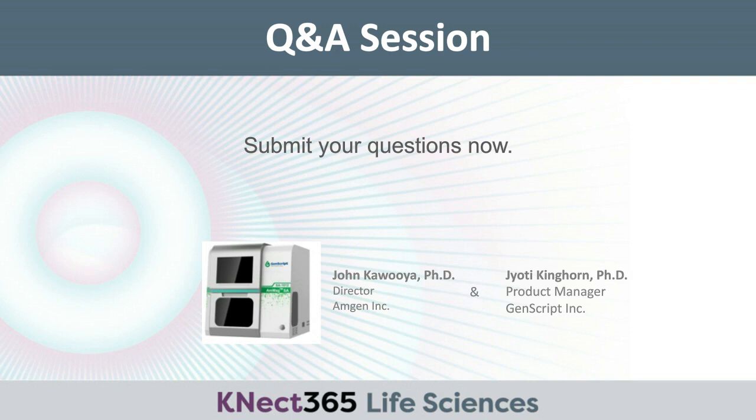No, you can use it in both. In fact, our laboratory now is switching our platform. We're getting rid of centrifuges in general, because of space and the time it takes. Purification using magnetic beads is now becoming mainstream. And so you can use it in both. I think in both cases, the platform works perfect. But to scale up, we find it even more exciting to use them at a larger scale because of the cycle time you reduce. And now the people doing expression are becoming protein purifiers. And the technology has brought them into mainstream, that they can now express proteins and purify them even in the bioreactors.